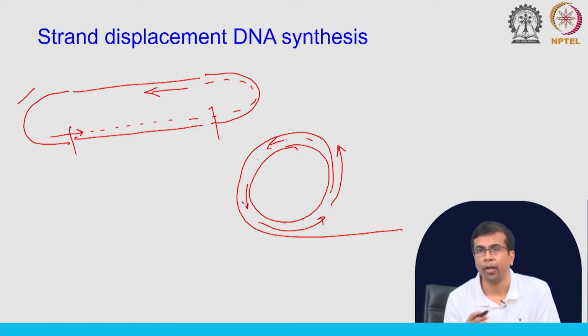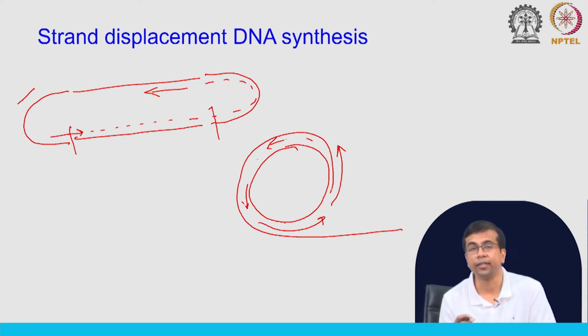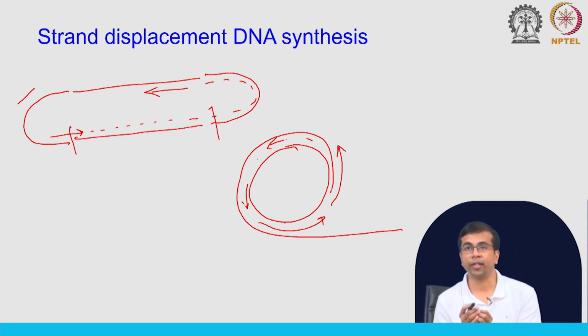Okay. Why would you do that? So, we will talk about that in a moment, why we want to do this, why you want to sequence the same molecule multiple times. Okay. But there is this capability where you can actually do this strand displacement DNA synthesis, so that you go over the same sequence multiple times.